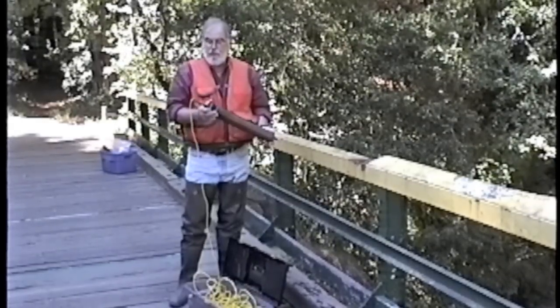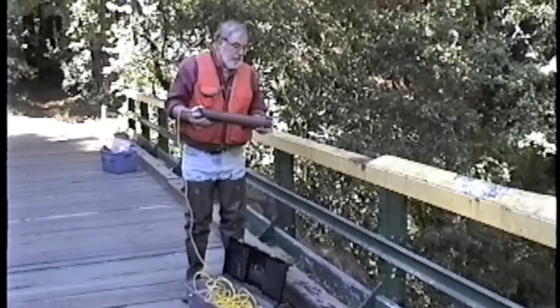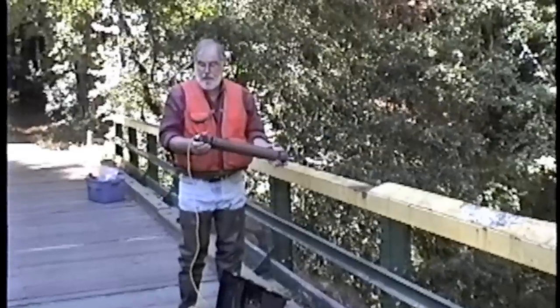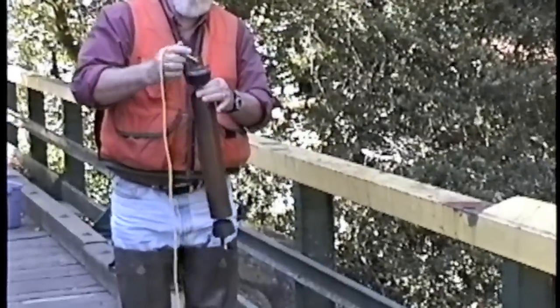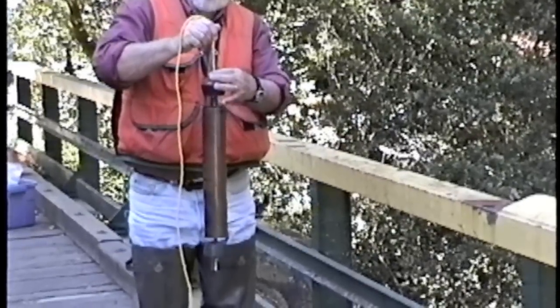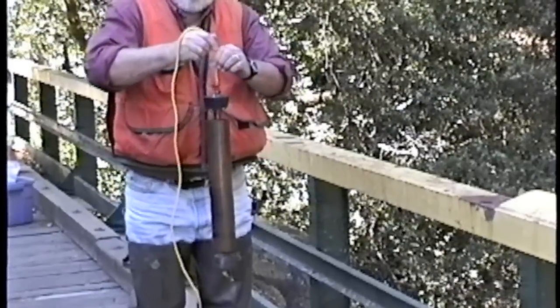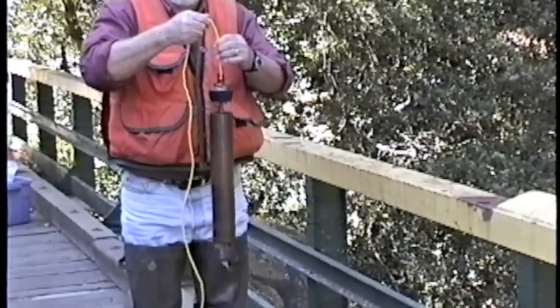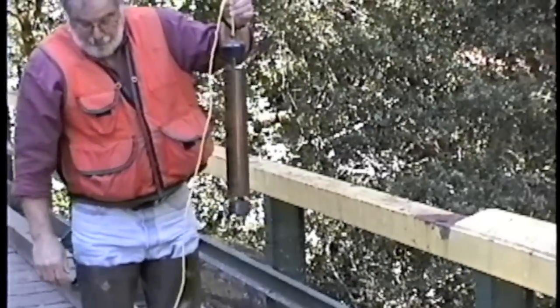I'm now going to demonstrate how to cock the sampler and get it ready for sampling. You simply remove the two end caps, pull it tightly, and the cocking mechanism locks onto the brass washer on top of the central tube and holds the end caps open. The sampler should be properly cleaned and rinsed prior to use.